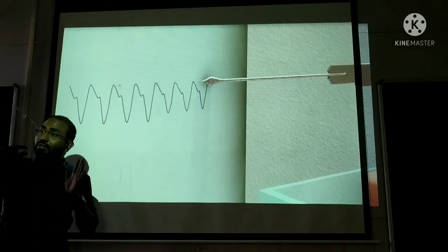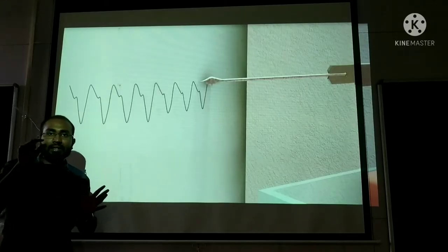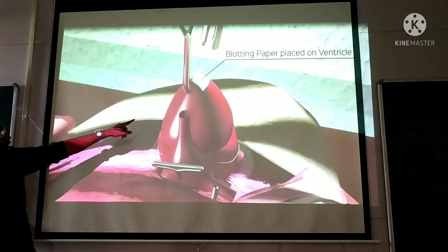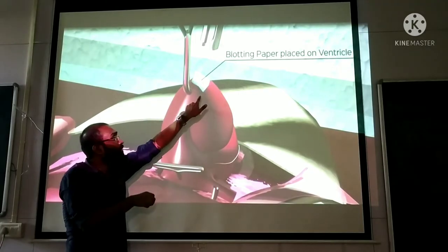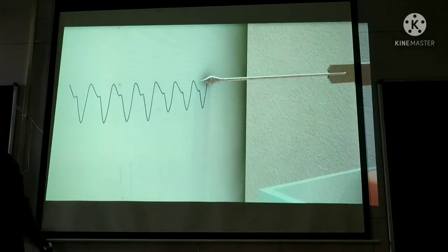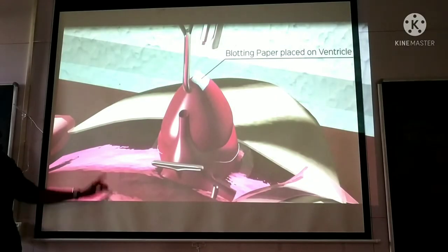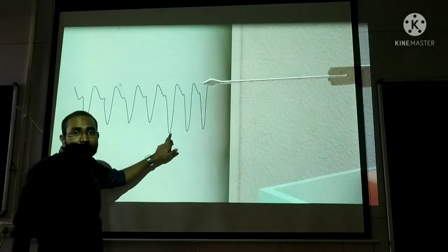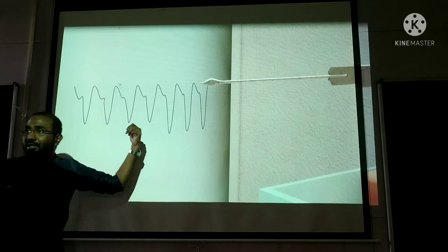The reason: we are adding cold ringer to the ventricles only — we have not done anything to the pacemaker. No temperature change was applied to the pacemaker, only to the ventricles. So the effect seen is: height of contraction decreased. With warm ringer solution on the ventricles, the force of contraction increased compared to normal. So cold decreases and warm increases the force of contraction when applied to ventricles.